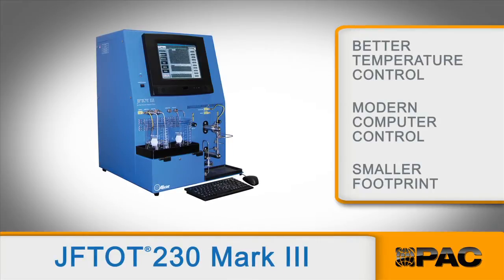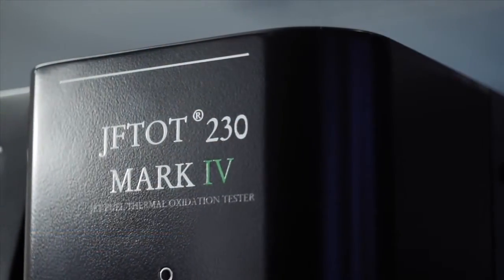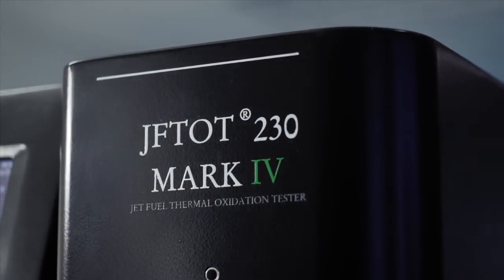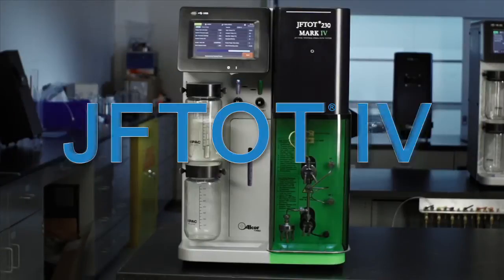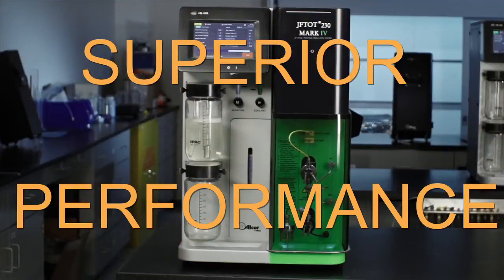Six generations of Jephtots have led us to the Jet Fuel Thermal Oxidation Tester of today, the Jephtot 230 Mark IV. The Jephtot 4 takes Jet Fuel Thermal Oxidation Testing to a new level of superior performance.